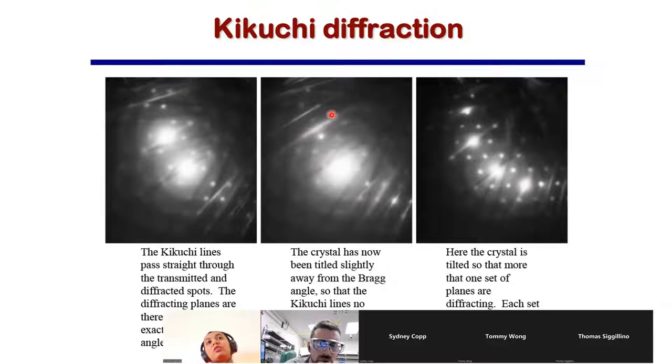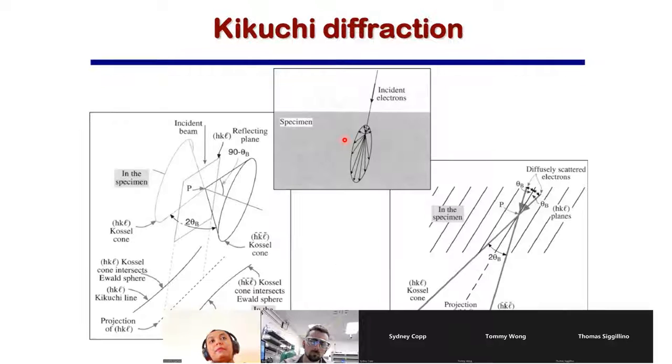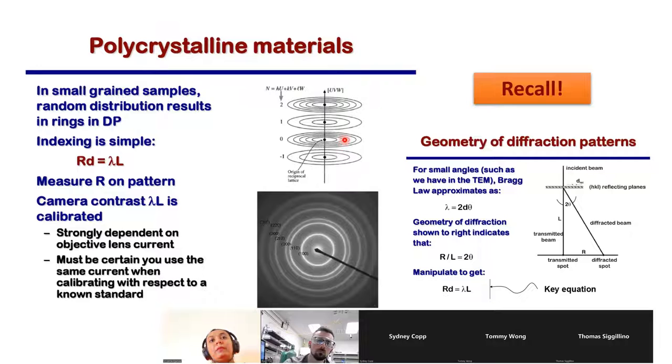And these lines, as I told you last time, the Kikuchi diffraction pattern is basically forming from the inelastic scattering of the planes. So these lines are actually the planes. These dots are coming from a concentrated family of planes. This represents the family of planes, and from these planes, it acts as the map or a road to reach these points. So this is what you would be seeing in most of the cases.